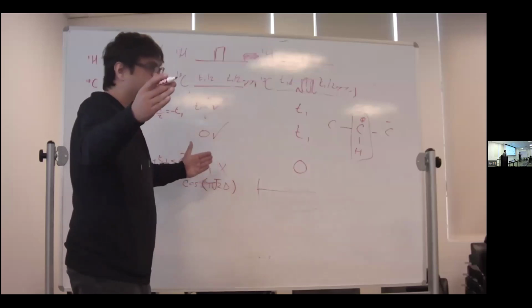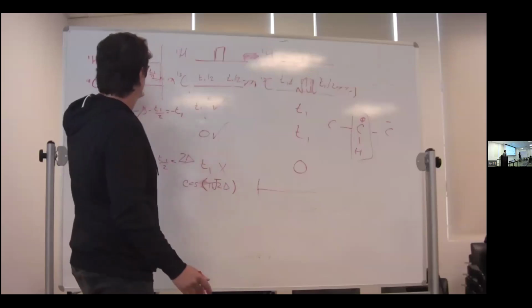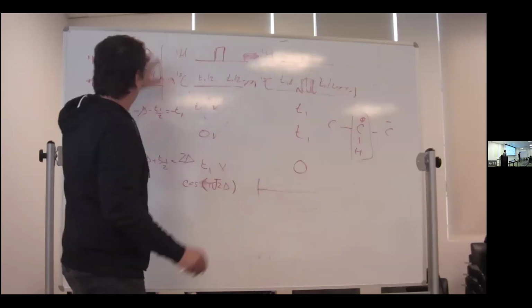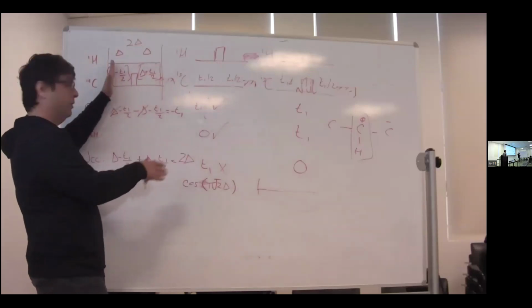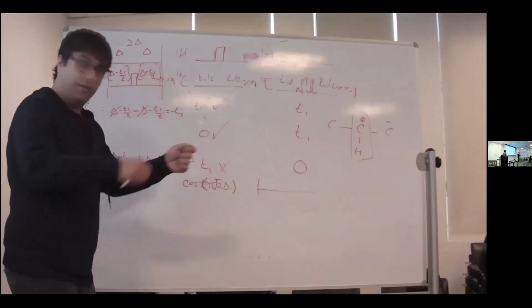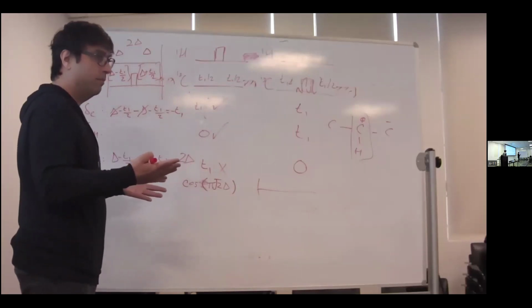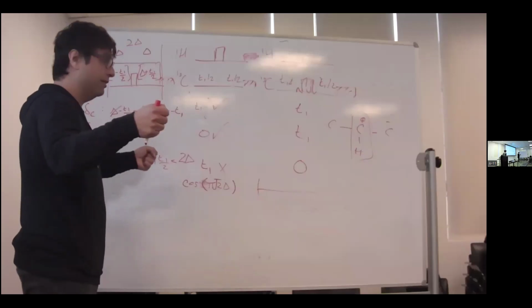The question of how long you want it to be dictates ultimately how much chemical shift evolution. Within this narrow range of delta, you can keep decrementing, but at some point you hit the wall. As long as you're happy that that's enough chemical shift evolution to resolve your peaks, you might be satisfied. Or you might come back and say, no, that's not enough. I need a larger delta.